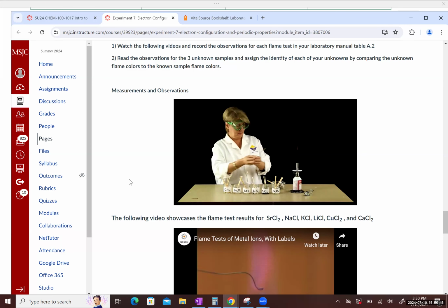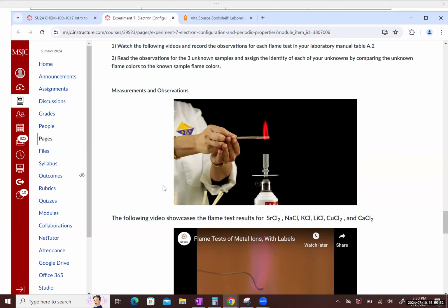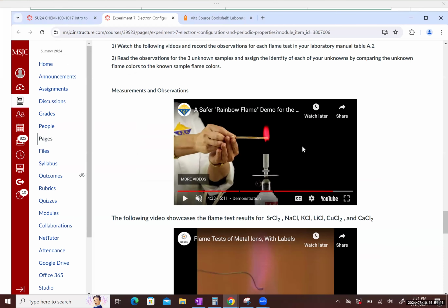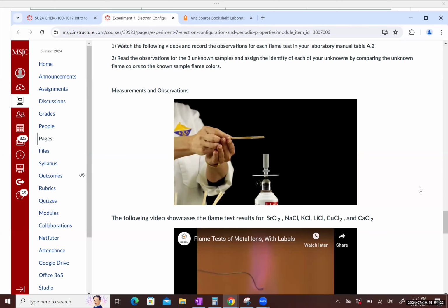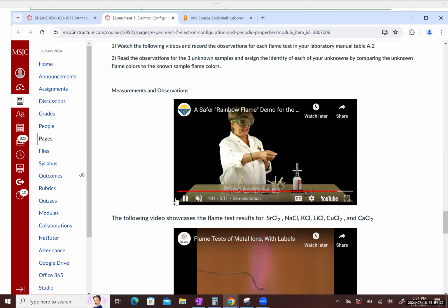Now for strontium, this will be pretty dramatic. So as you can see, for strontium, we observe a pretty clear, bright red. Strontium is commonly used in road flares. It also can be used in fireworks, and it has a pretty dramatic atomic emission spectra, as you can observe by the brilliant red flame observed. Okay. So with that, they've concluded this demonstration video.